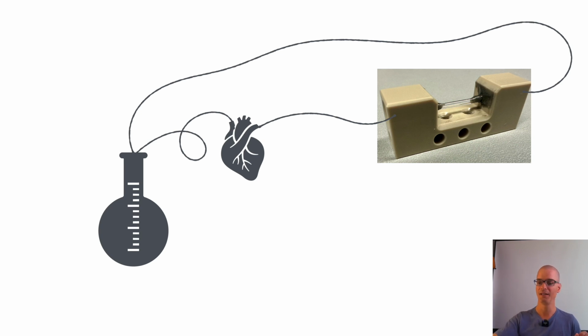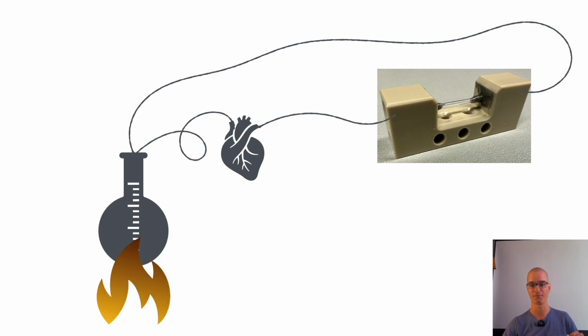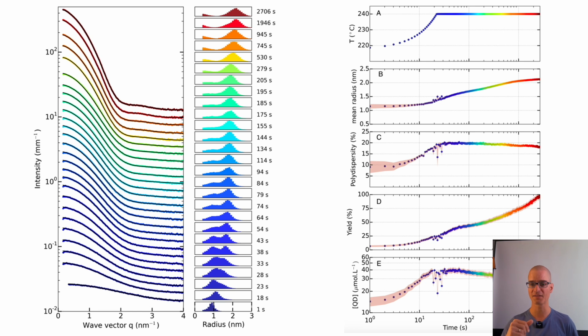And of course, in this case, if you want to start a reaction, you have to add some heat to the reaction vessel, which is exactly what they did. So after some initial attempts with classical models, just like us, they ended up using McSAS because of the complexity of the particle formation.